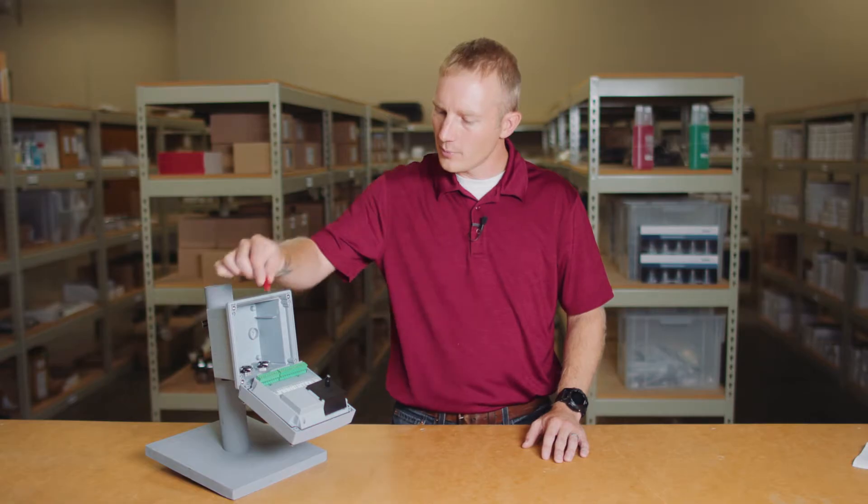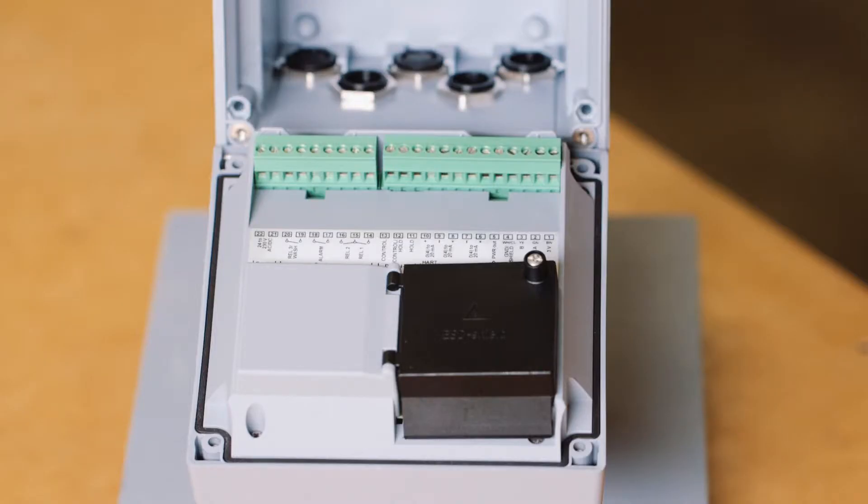Next on the rail are the terminals for the relay contacts. The Stratus Evo provides four relay contacts: the first is dedicated to a wash cycle, next an alarm, and the third and fourth are dedicated to high and low limit detection.